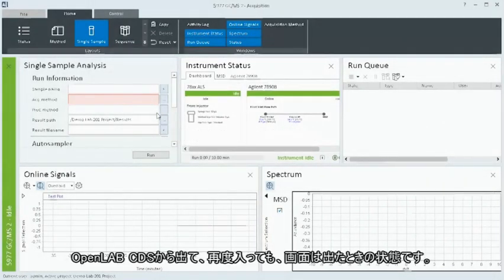When you leave OpenLab CDS and return later, the display will be just as you left it.